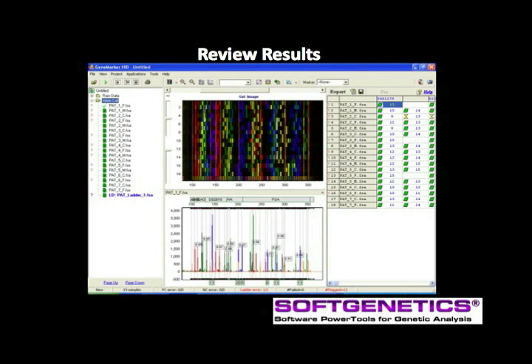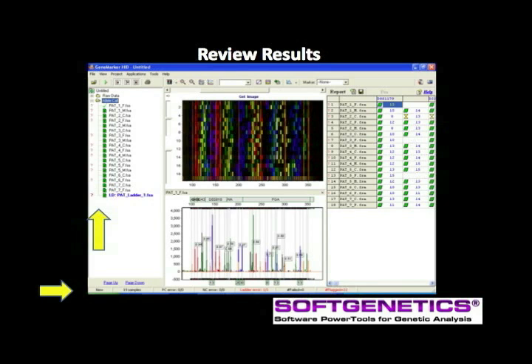Analysis is rapid, typically taking about 20 seconds to analyze 96 samples. The file name tree at the left has two quality indicators. Red question marks alert the analyst that samples have caused one or more analysis rules to be fired and will require review. Green sheets in front of each file name indicate that size calls were all of high quality. Yellow sheets indicate the size calls should be reviewed, and red sheets indicate sizing did not occur — often the result of a failing capillary or not enough size standard loaded. At the bottom of the screen, a summary of the analysis is shown, including the number of samples, positive and negative control concordance, ladder error, number of failed, and number of flagged samples.